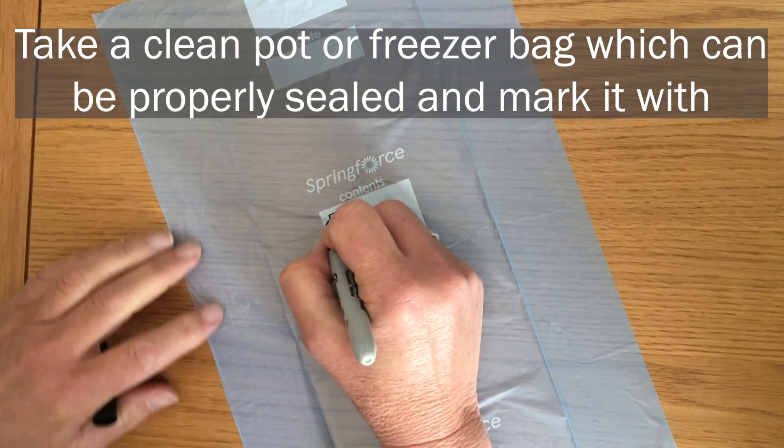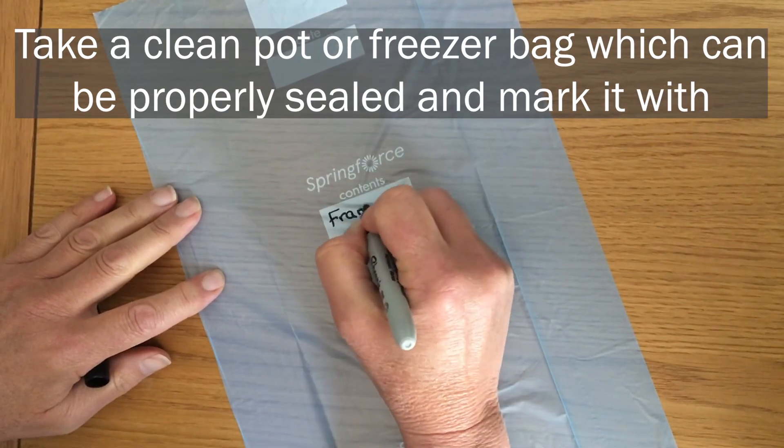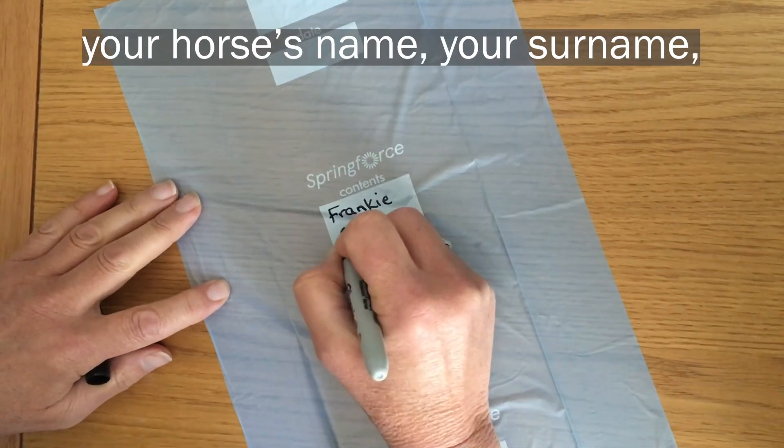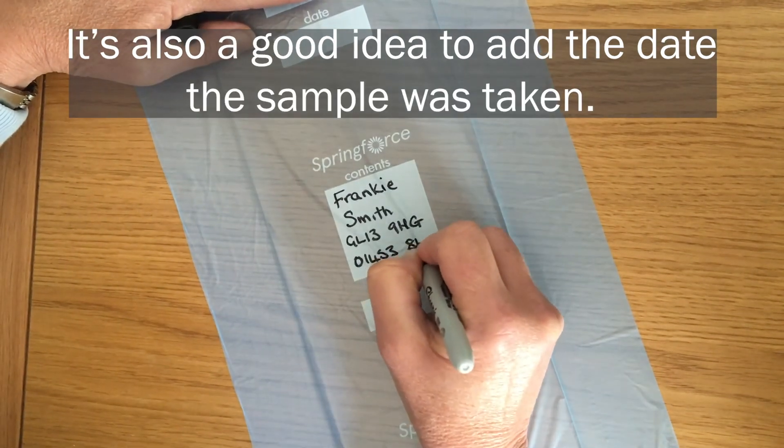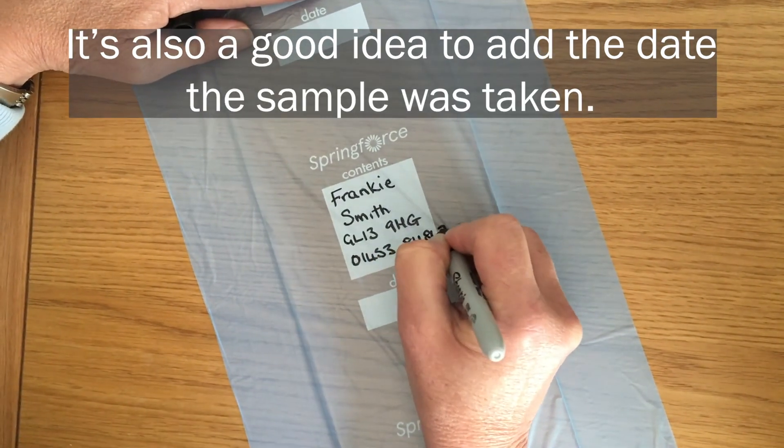Take a clean pot or freezer bag which can be properly sealed and mark it with your horse's name, your surname, your postcode and telephone number. It's also a good idea to add the date the sample was taken.